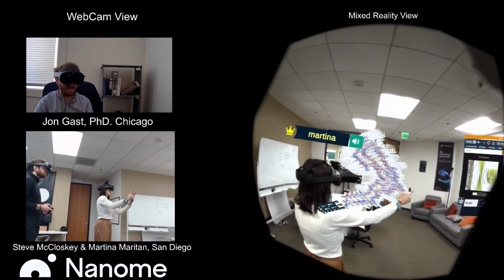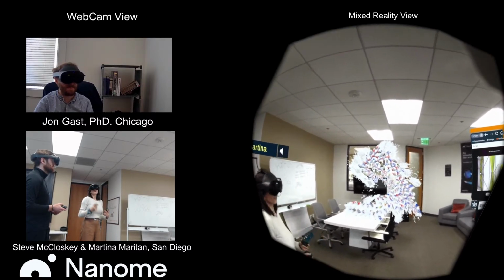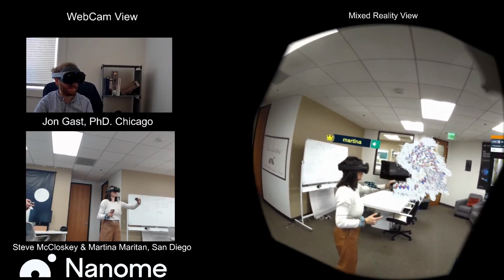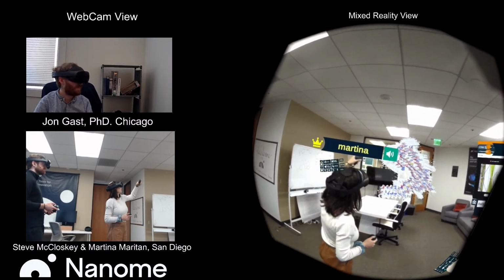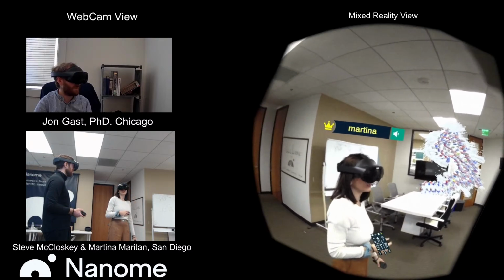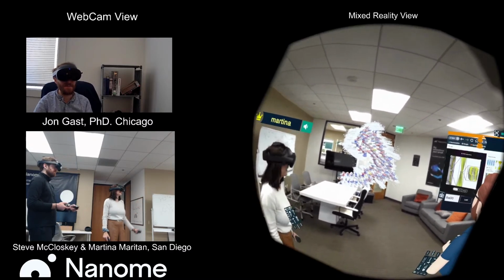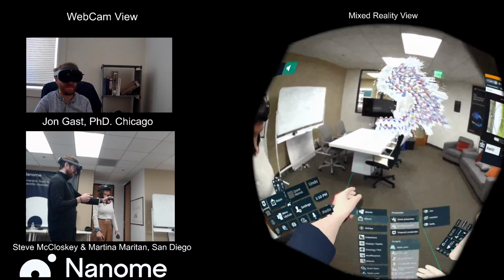As I said, they are really big, and techniques like crystallography and NMR were not able to capture this big structure, while cryo-EM gave us an excellent tool to actually study what's going on in, in this case, sheep's brain, but in other cases in our brains. That's great, Martina.